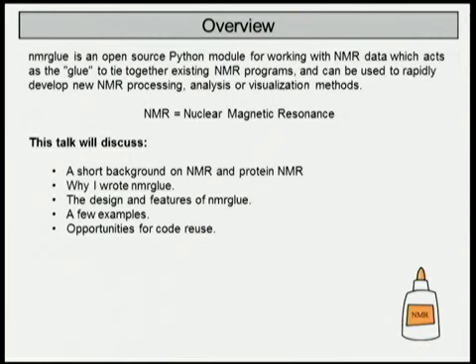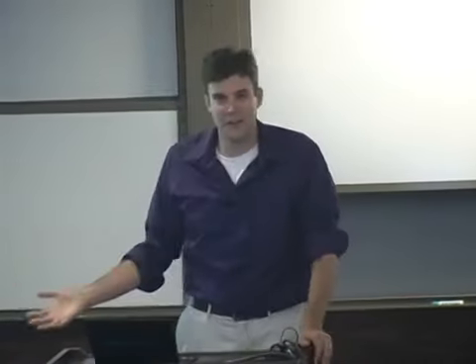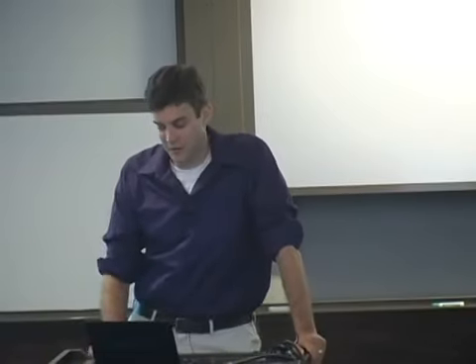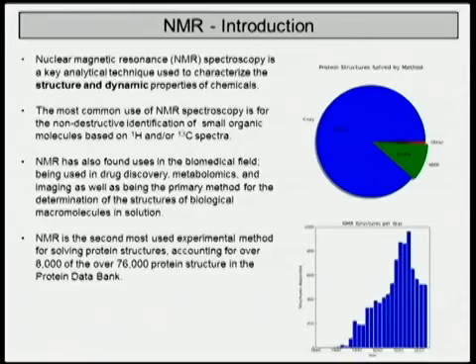So in this talk, I'm going to give a short background on NMR and protein NMR, discuss a little bit about why I wrote nmrglue and some of its design and features, give you some examples, and then since most of you are probably never going to run NMR, some opportunities for code reuse that you might want to use from nmrglue.